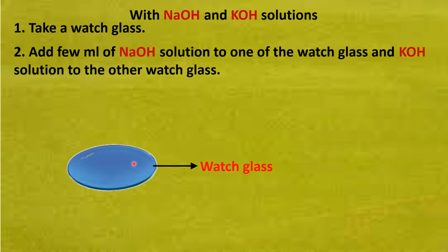We are bringing sodium hydroxide solution and then we'll just add it to the watch glass. Few ml or few drops. Okay, this is the sodium hydroxide solution.